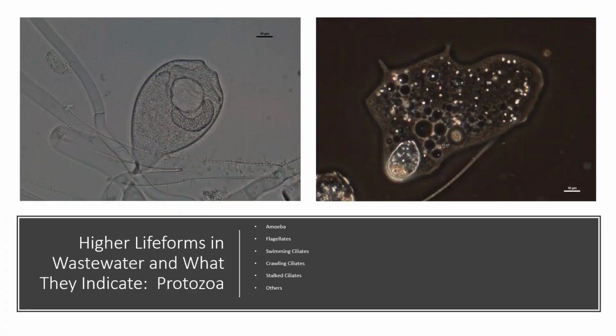So another thing, people love to look at higher life forms in their wastewater plants, probably because they're easier to see and they do the most interesting things when you look at them under the microscope. This is what we have operators doing microanalysis. A lot of the time they'll talk a lot about these, and they are kind of fun.